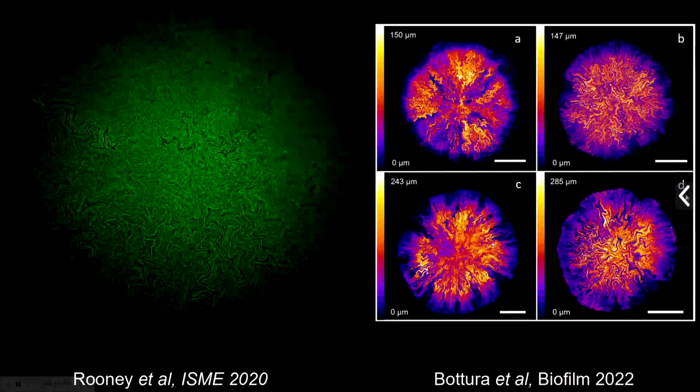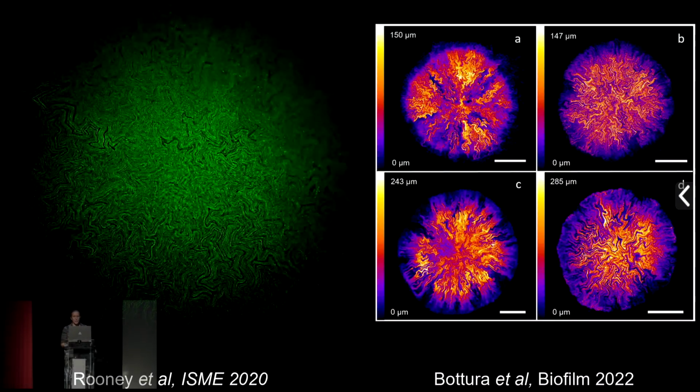There we go. We've also used this not just for imaging fixed and cleared tissue, but even in camera imaging with fluorescence contrast, we can start to make real inroads into cell biology. So roughly half of my group are now cell biologists, most of whom are microbiologists. It's a happy accident. I'm delighted about this. And what we're often looking at is ultrastructure in mature colony biofilms.